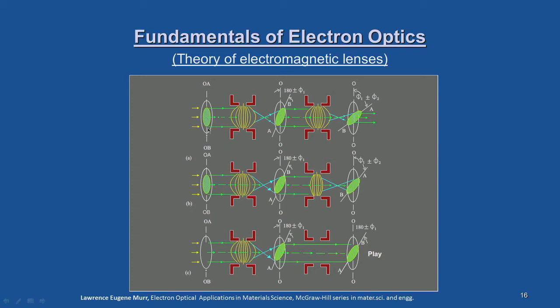So, carefully if you see the next schematic, the animation clearly showed that the first lens has the same strength as the previous one. So, it has undergone an inversion plus rotation, but the second lens there is a difference. I hope you will be able to appreciate this. You see that the number of lines have come down, that indicates the field strength has come down. So, you see the similar reaction takes place here, that means this rotation also will come down.